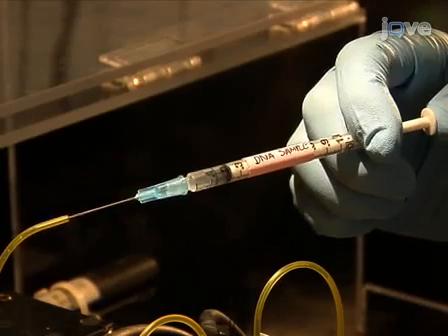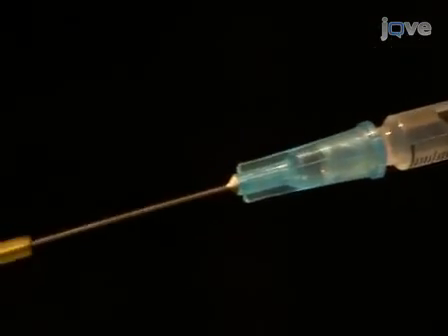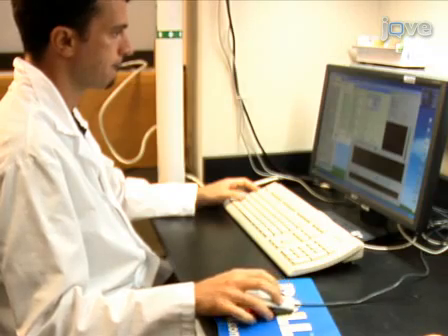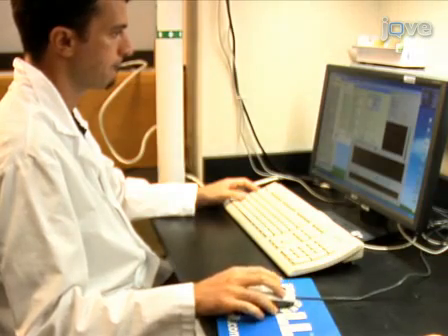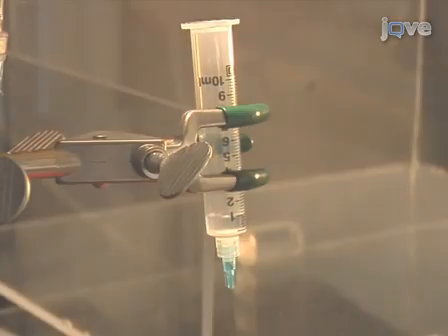Finally, flow a solution of 3 to 5 picomolar of the biotinylated sample. To check the coverage of fluorescent molecules, a surface scan is performed. Incubate the biotinylated sample for 10 minutes and repeat the flow of buffer A as shown previously.